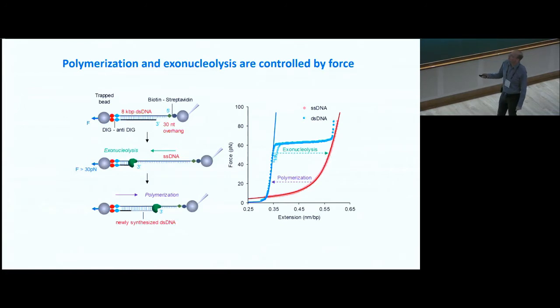They found that if you take a polymerase and if you have a construct, say, optical tweezers instrument like this, where you have a free 3' end, which normally a polymerase will come and start polymerizing from that end and add complementary bases. If you have that construct, you can see the polymerization by simply adding nucleotides and the polymerase. And if you hold your tweezers at constant force, you can measure the change in length as it polymerizes.